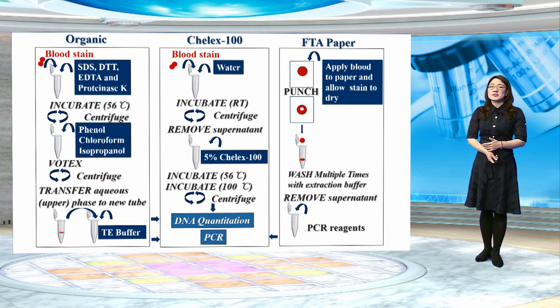However, it produces single-strand DNA as a result of the extraction process, and therefore is only useful for PCR-based testing procedures. Chelex 100 extraction is an advantage for PCR-based typing methods because it removes the inhibitors of PCR and uses only a single tube for the DNA extraction, which reduces the potential for laboratory-induced contamination.